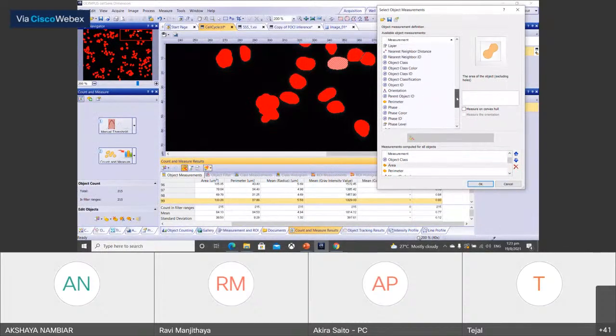So for example, if you want to add the irregularity, which we can see here, the circle is 1, and if it is a very flat kind of circle, then the value becomes bigger.